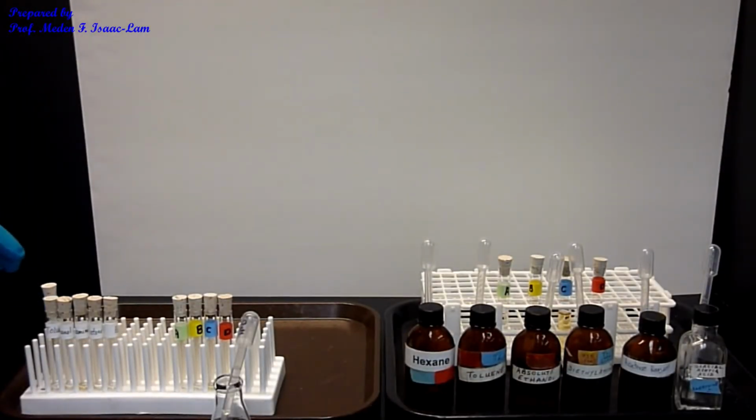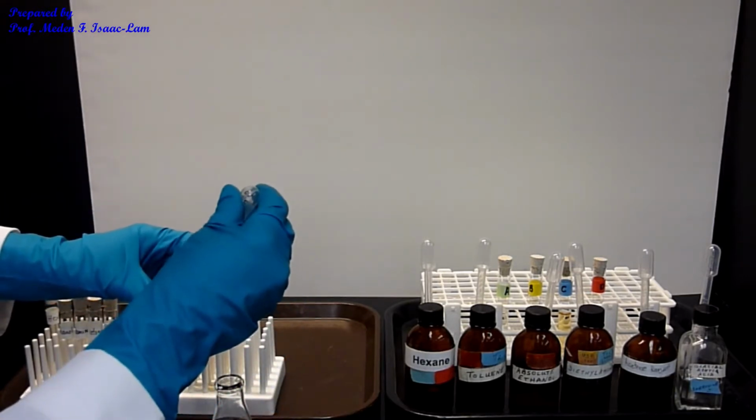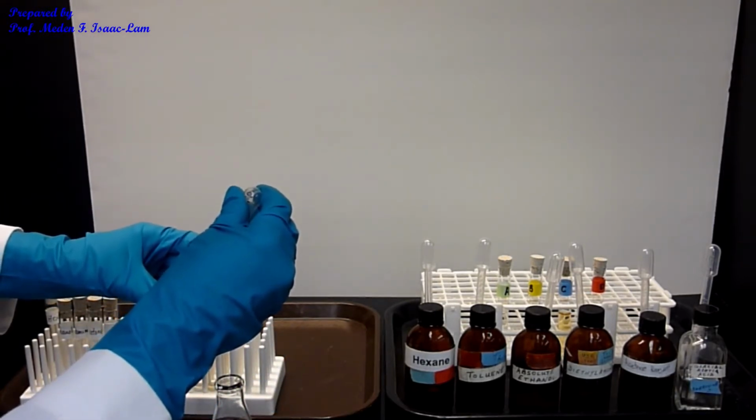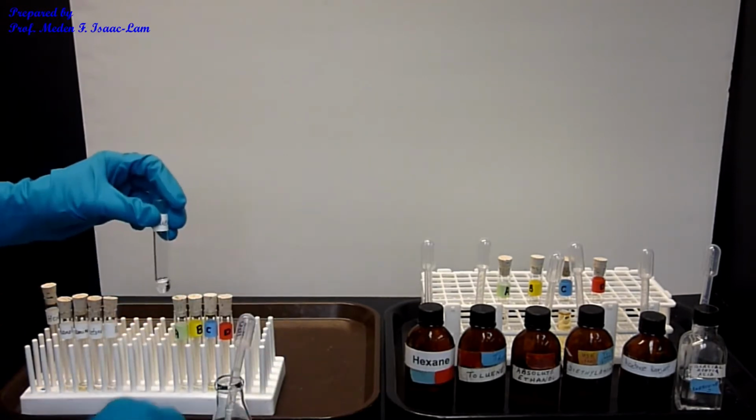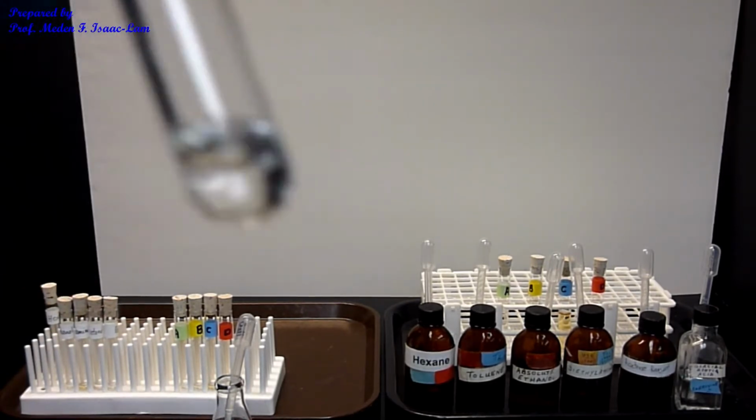I'll put that at the back, and now I'm going to do toluene. Again, I'm doing 10 drops of water, and then mix a little bit.